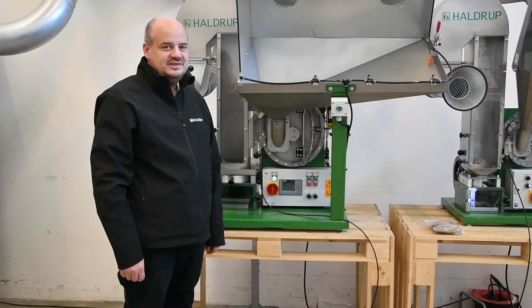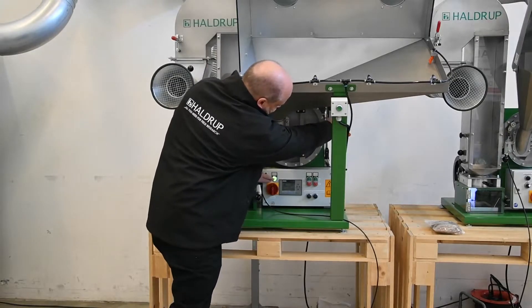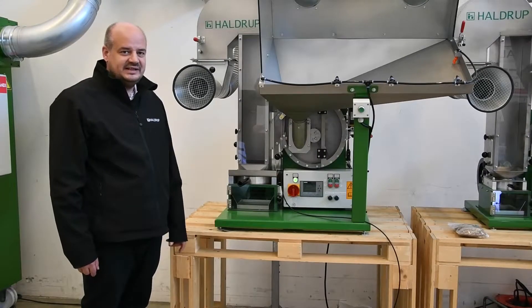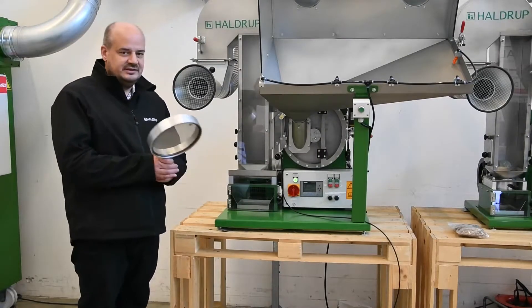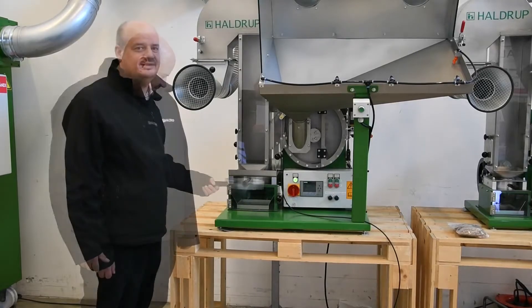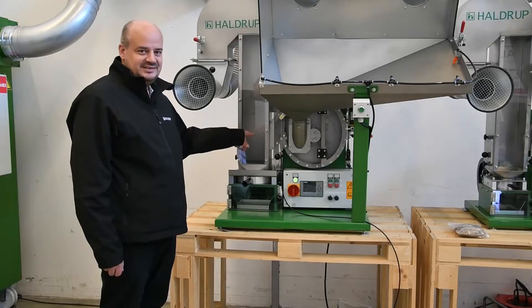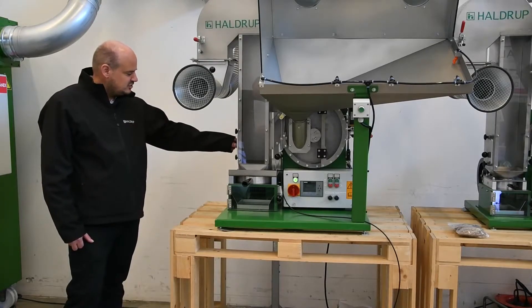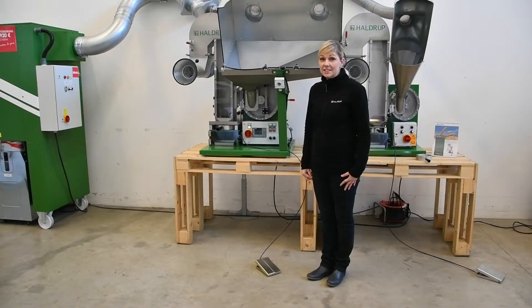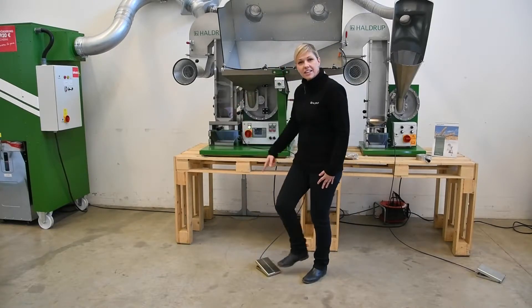When the safety switch is activated, you can open the door. We can offer two different types of sieves for the machine: 0.5 or 1 millimeter. There is a flap between the threshing unit and the cleaning unit, and there is also an inspection door on the side of the cleaning unit.